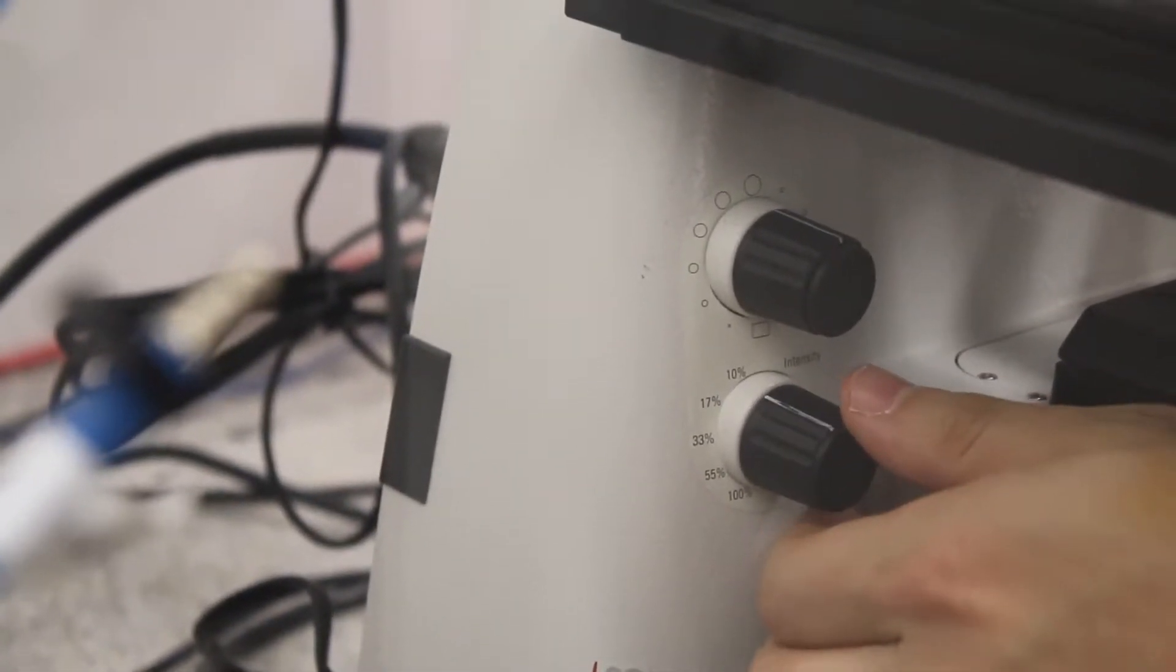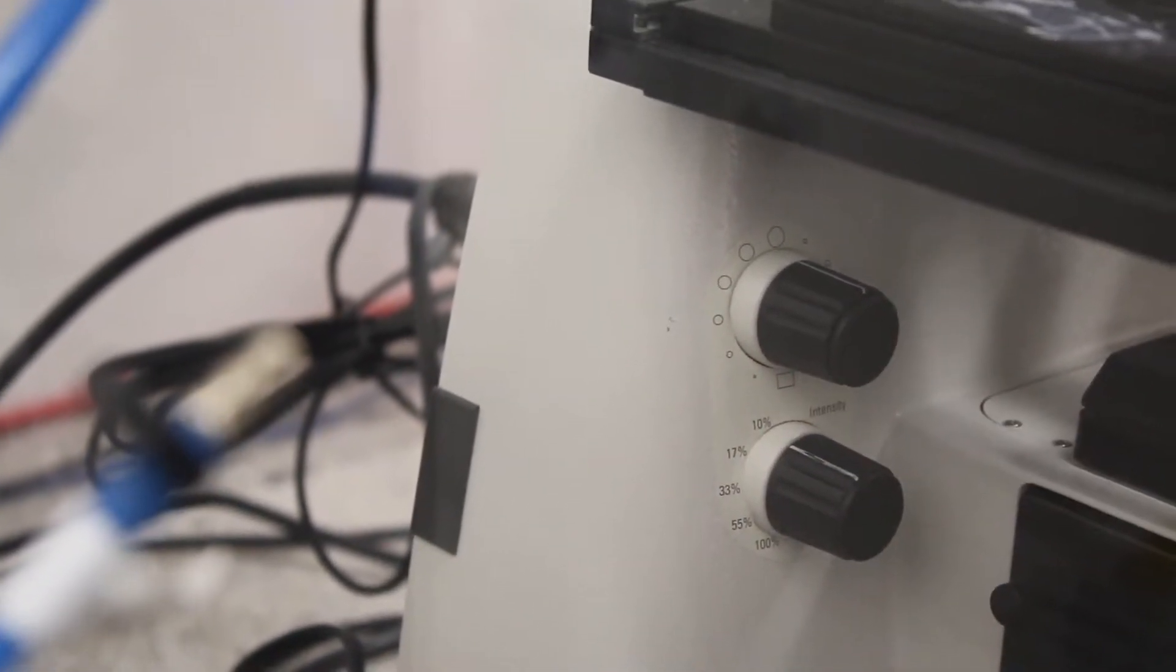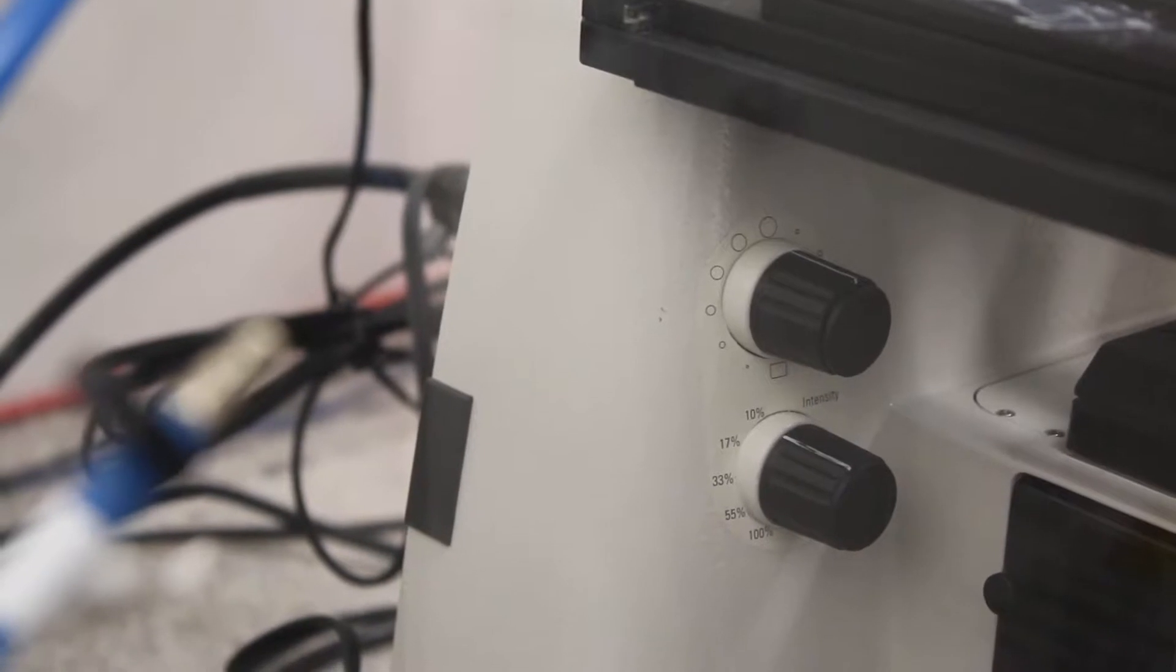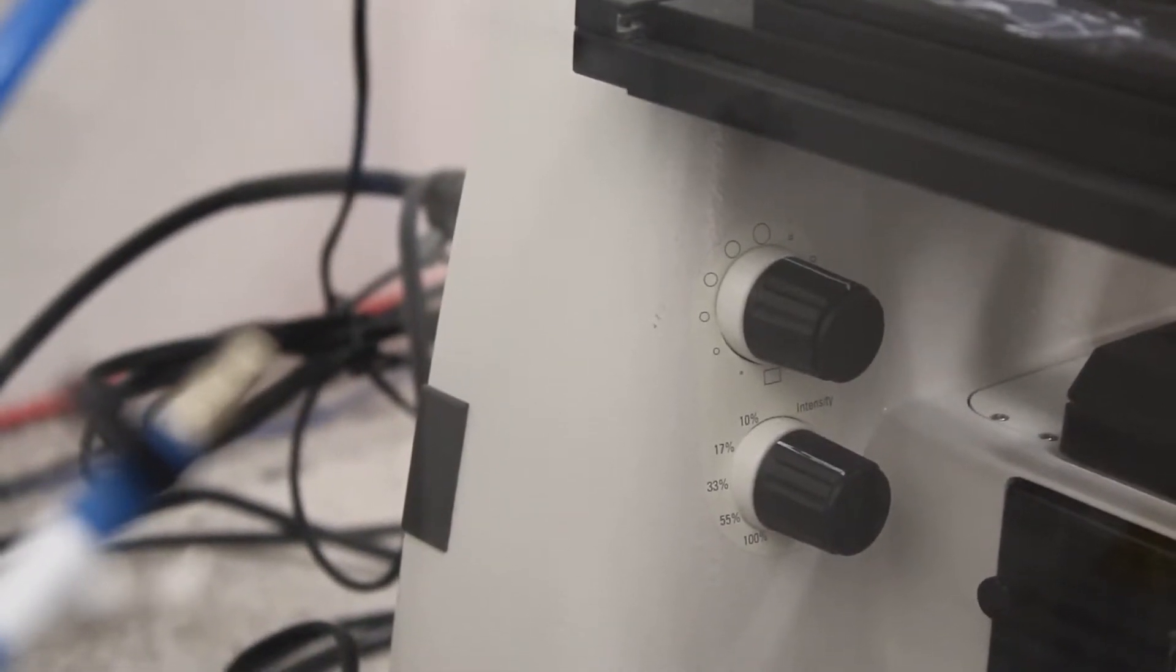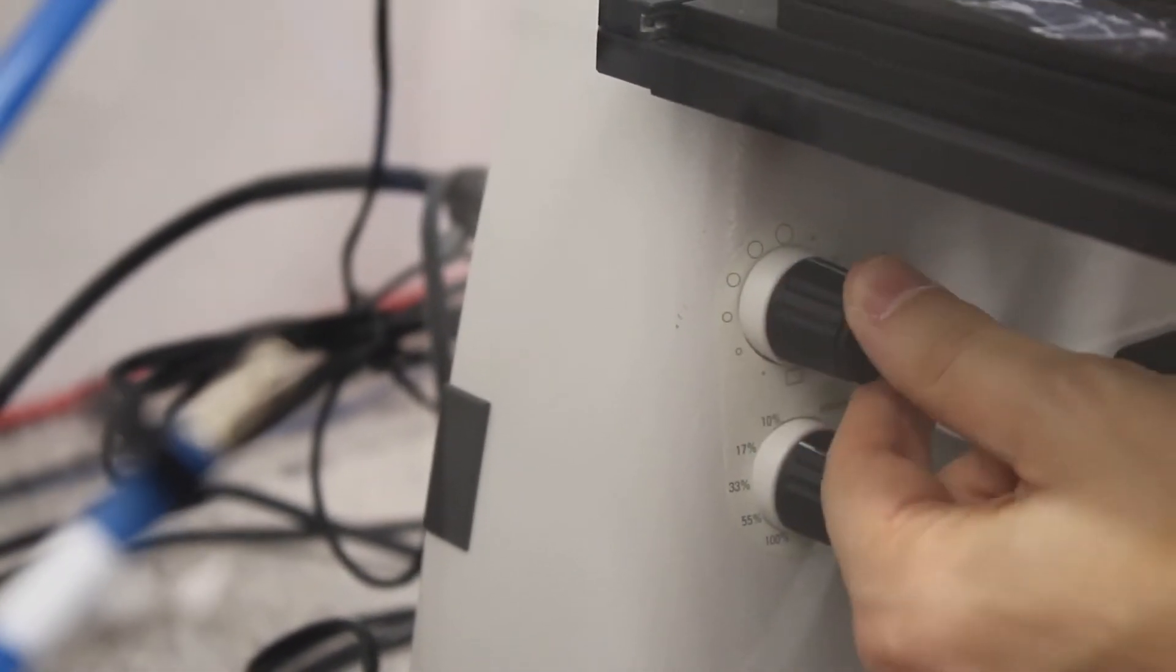33, 17, or 10%. And the top one will change the size of the irradiated area in your sample. So you can irradiate only a small portion of your sample by choosing again the size you want to irradiate.